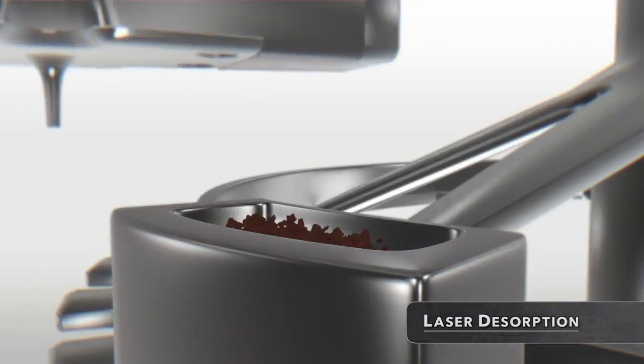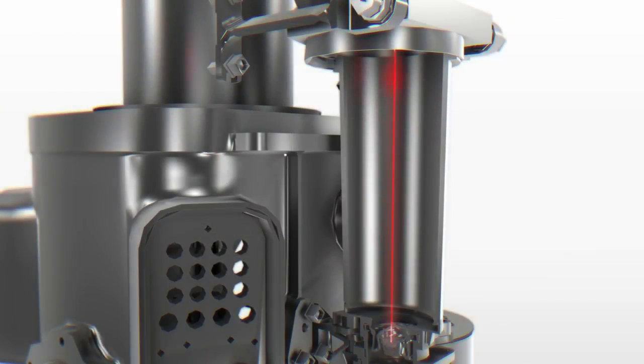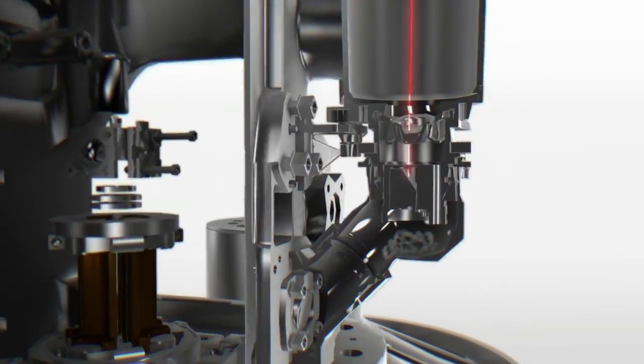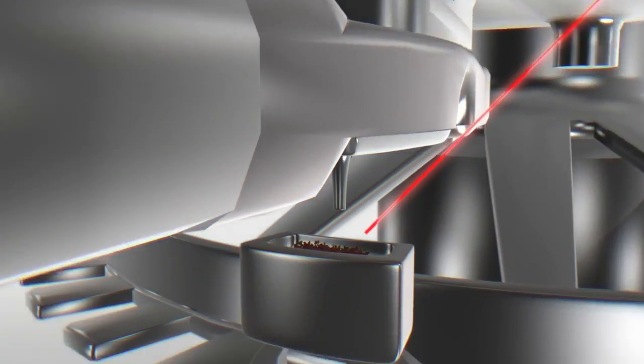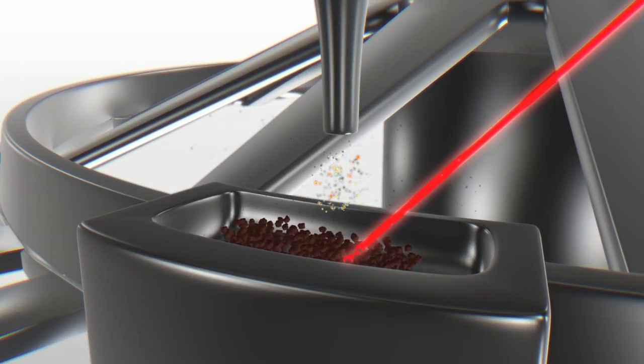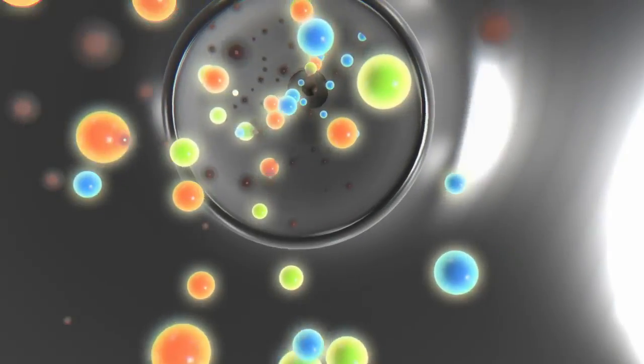A beam of energetic light builds within the laser and fires in a billionth of a second, concentrating its energy onto a spot smaller than a grain of sand. This rapidly vaporizes a portion of the sample, releasing large organic molecules that could be broken down by oven heating.